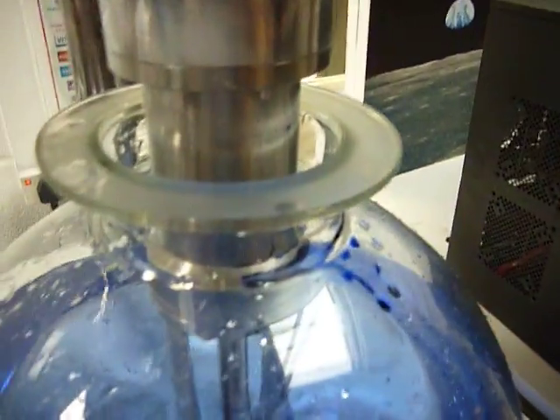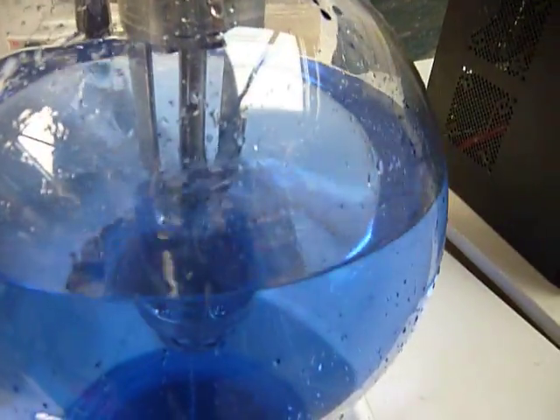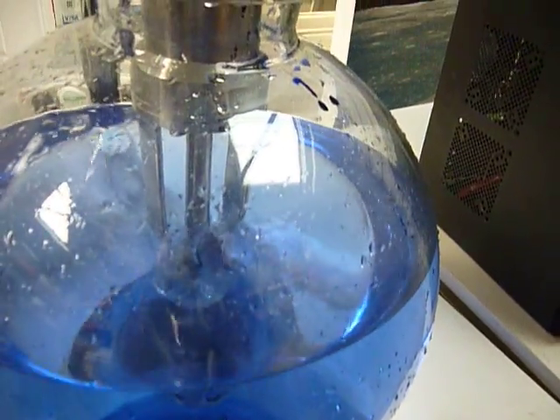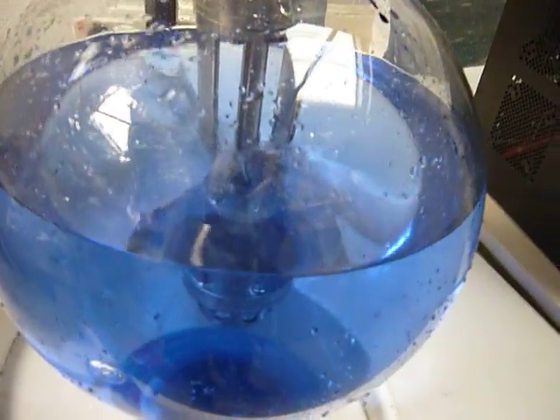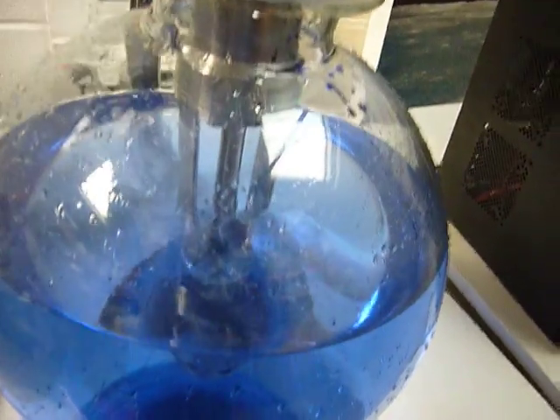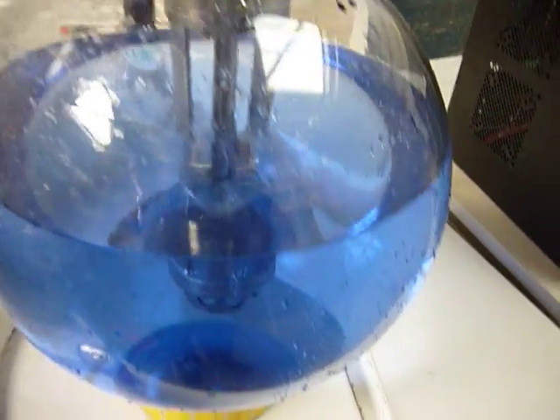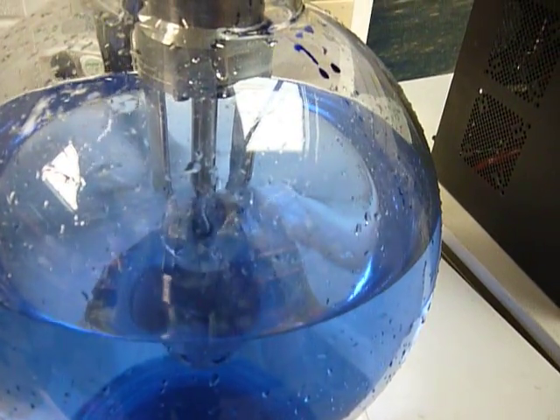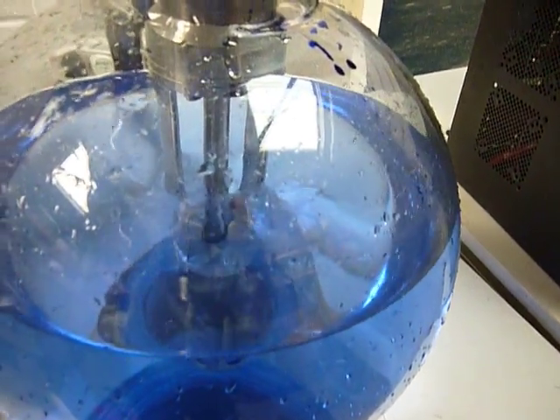All stainless steel contact parts. No problem with corrosion. All parts are readily available from Silverson. And these are extremely well made and very robust. Not a lot to go wrong on them. Simple motor shaft arrangement. As you can see the bearings are good on it. You can always tell with the Silverson. And that's a very smooth action.